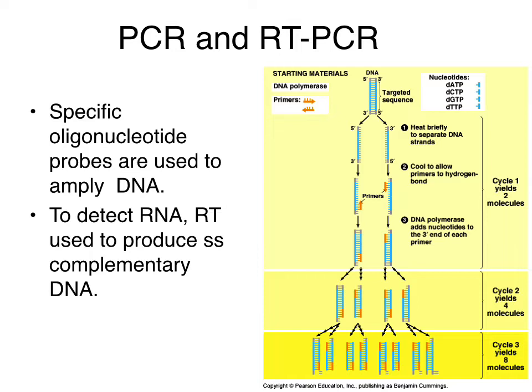Due to the importance and increasing use of PCR in detection and diagnosis, I want to focus on that procedure for a minute or two. PCR is a simple, sensitive, and versatile technique that can provide results rapidly. This method is used to create or amplify huge numbers of copies of a specific DNA fragment. Because both strands are copied, there is an exponential increase in the number of copies of the gene.